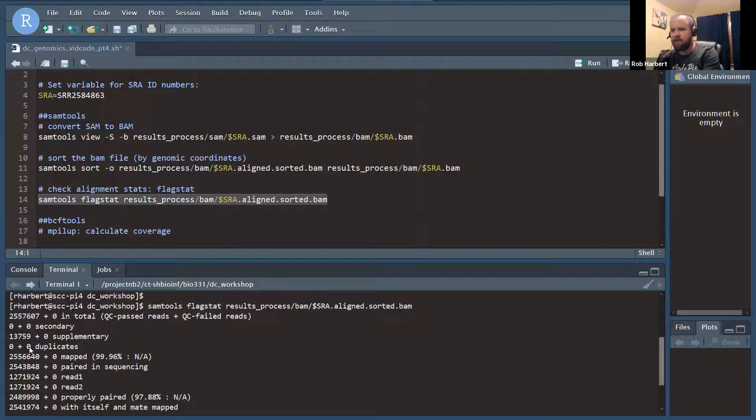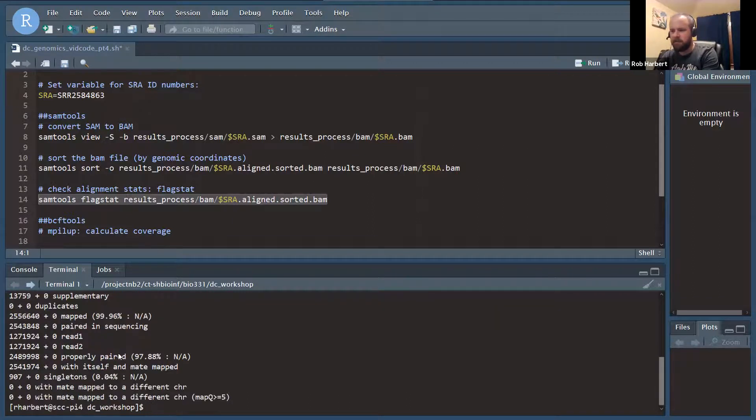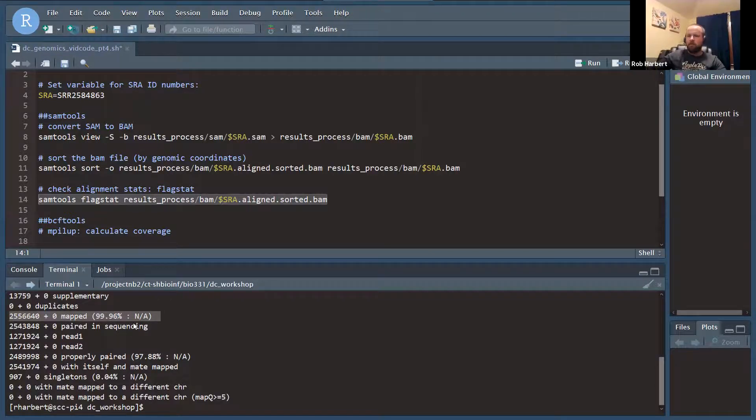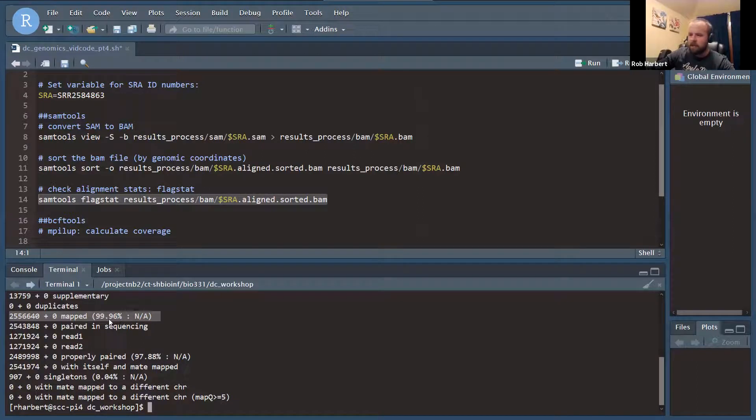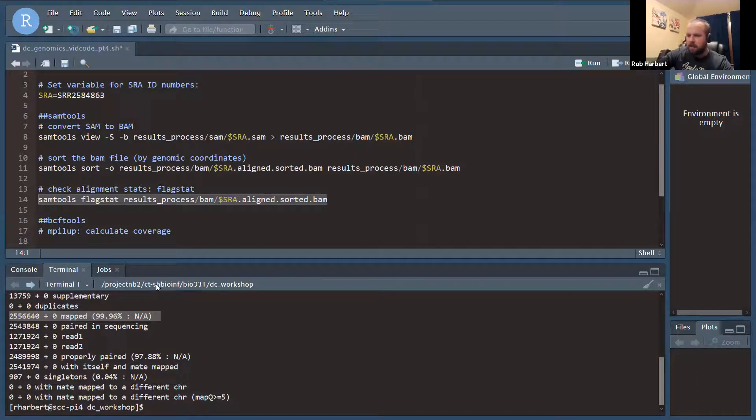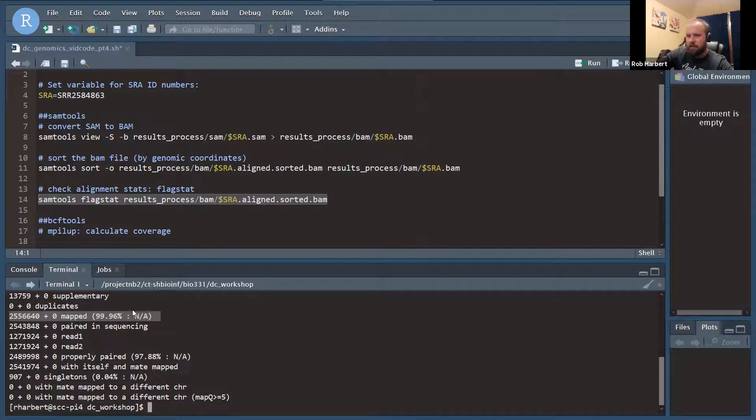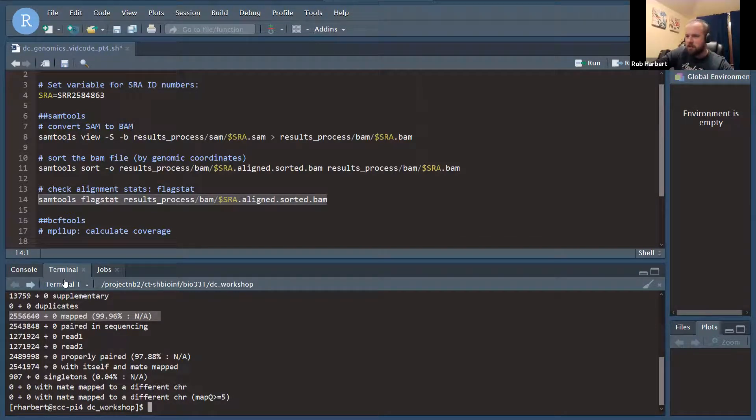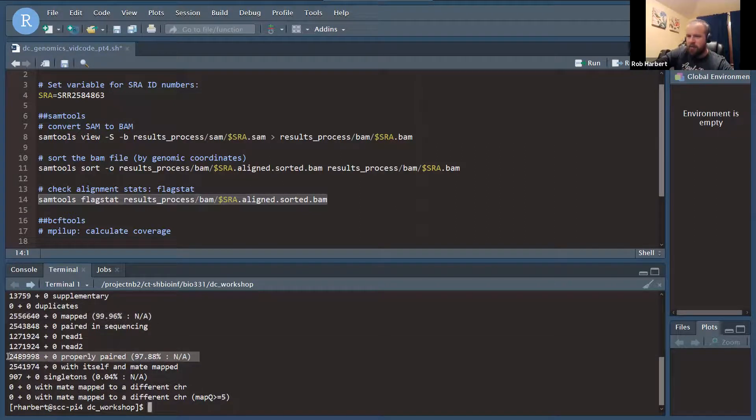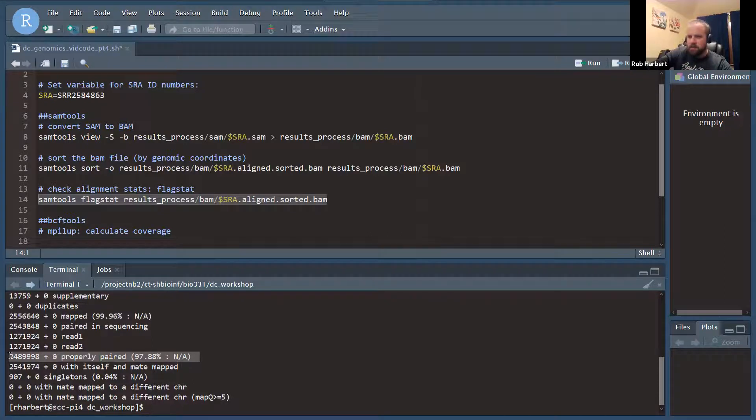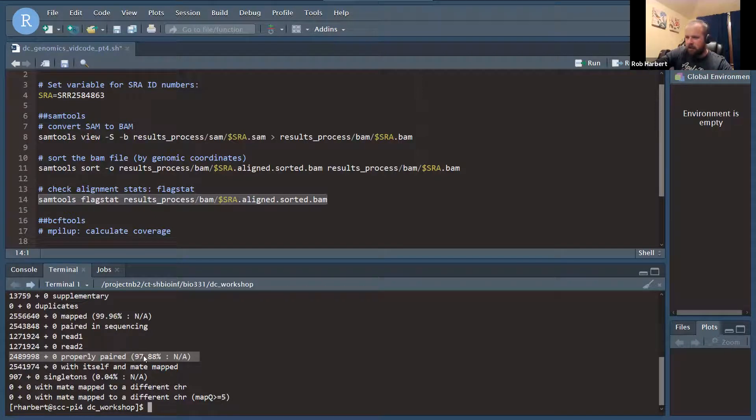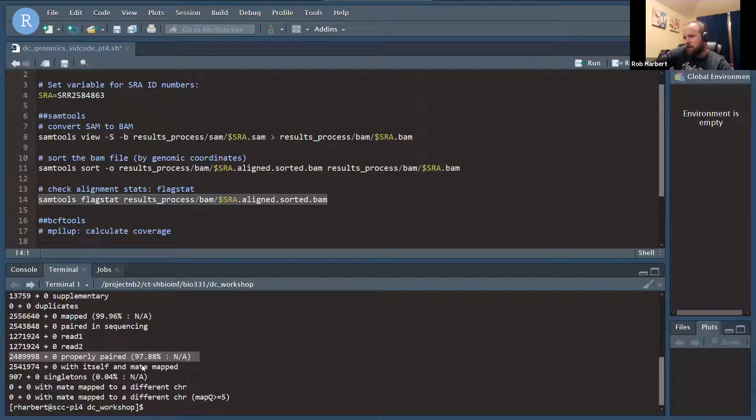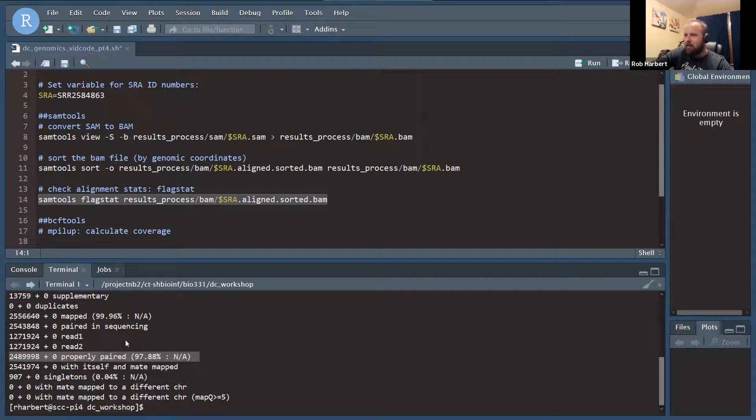Flagstat gives us information about how our reads have mapped. It's pretty straightforward. Almost all of our reads in the dataset, all 2.5 million of those mapped, 99.96%. That's a really good sign. If you have some contamination, maybe not all your reads came from that genome, that number could be lower, and it's not necessarily a bad thing, just to be sure that you still have enough mapping to answer the question that you want to answer. We don't have issues with our reads aligning but not in the right order. 97.8% of those passed properly paired. So I'm happy with that. That's a nice, clean dataset.